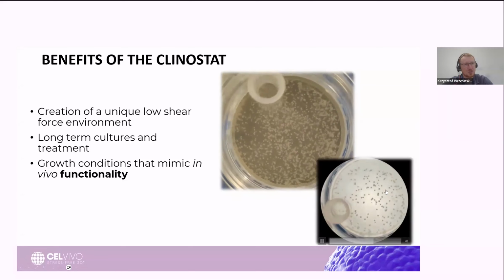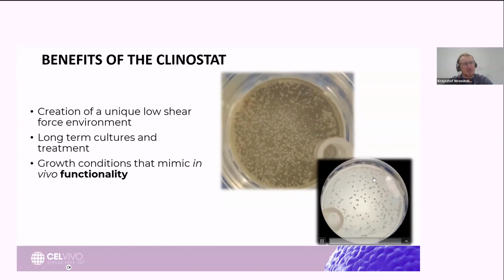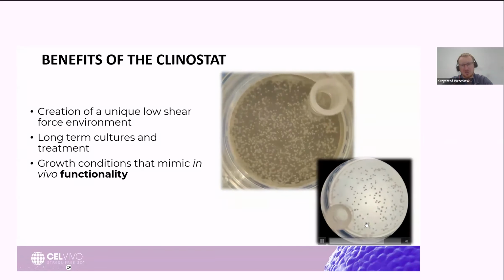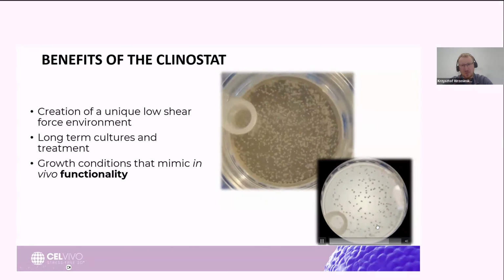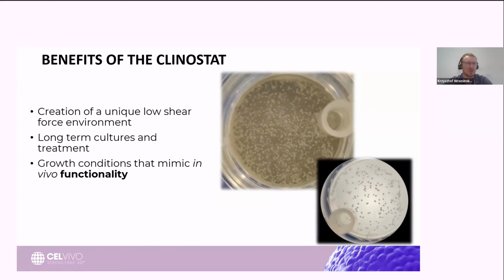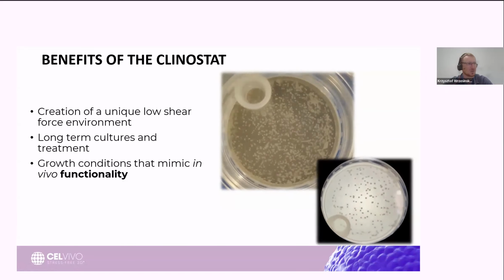If you look at this electronically removed rotation of the vessel, they have very little movement inside the system, and those small movements allow us to eliminate the diffusion depletion zone without an excessive increase of shear force.